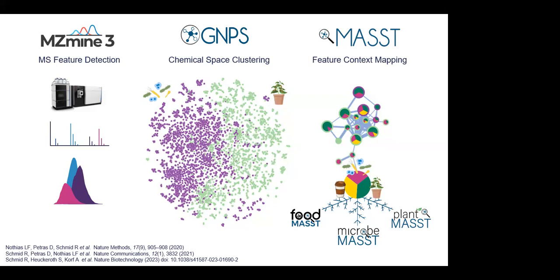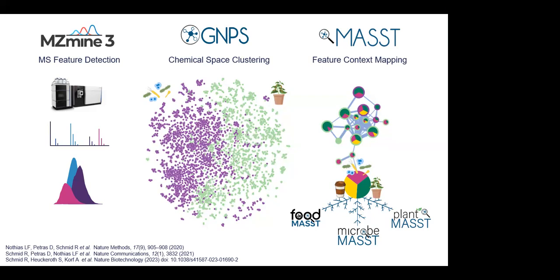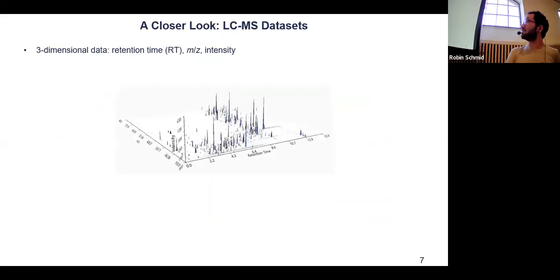And then you might be seeing that it might be something microbe-derived, food-derived, maybe it's from environmental samples. So someone already detected it. And that might help guide you in further analysis.